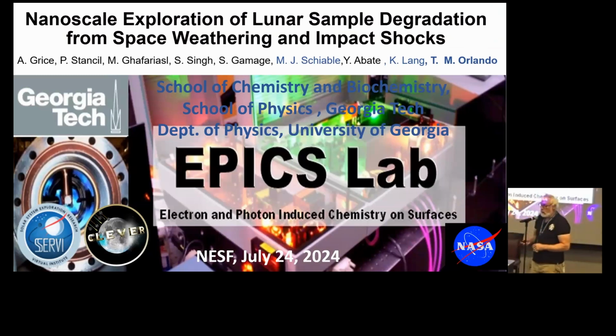Thank you for the opportunity to give an overview. This will follow the previous talk in many respects. We're going to be talking about using AFM FTIR to look at impact events and space weathering. But in this case, we're looking at actual lunar samples.